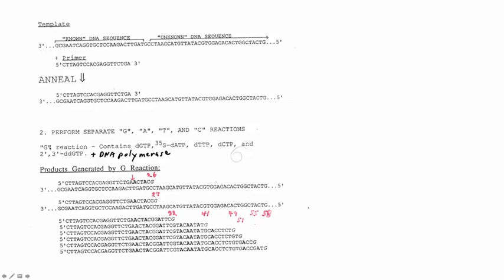But the important thing is, in a G reaction, you would have dideoxy G added.